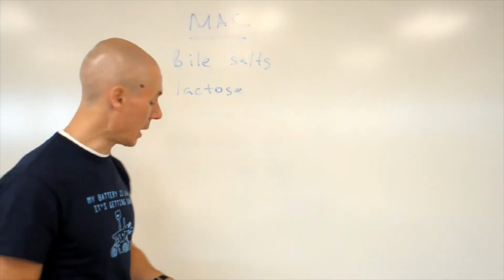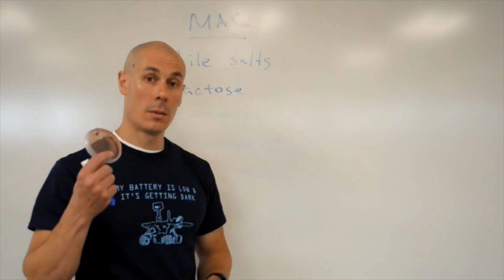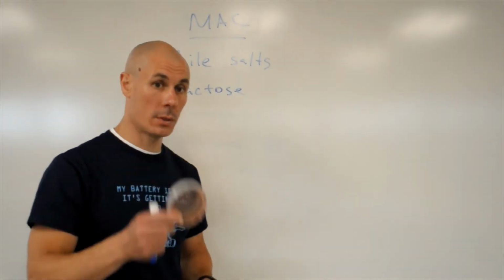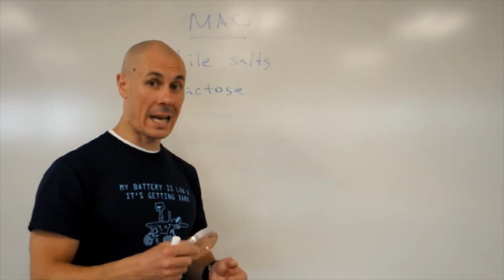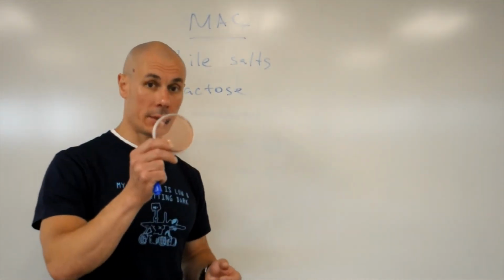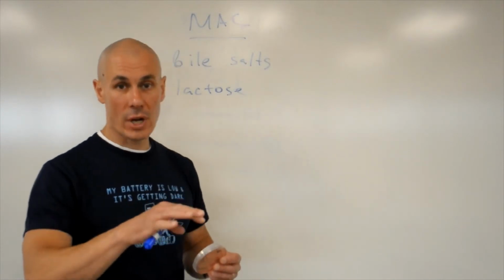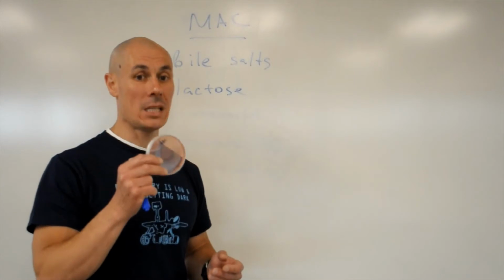How do we distinguish lactose fermentation? It turns out that when bacteria ferment lactose, as you can imagine, they produce acid. That acid leads to the change of the color of the colonies from kind of transparent to orange-y pink.